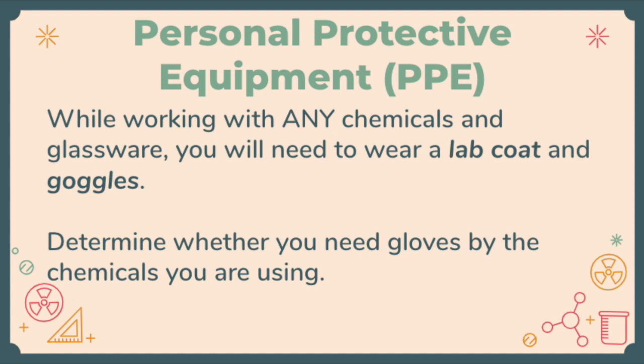Personal protective equipment, or PPE. While working with any chemicals and glassware, you will need to wear a lab coat and goggles. Determine whether you need gloves by the chemicals you are using or just personal preference.